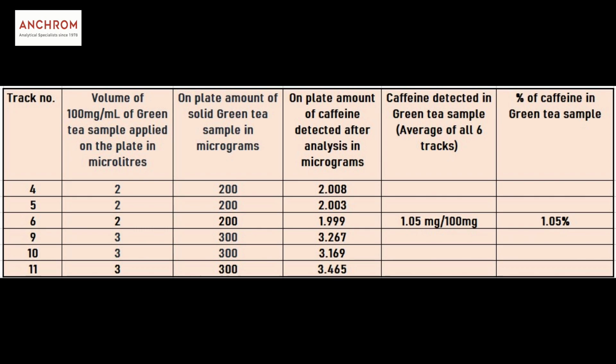Congratulations! You have successfully navigated the Evaluation tab.